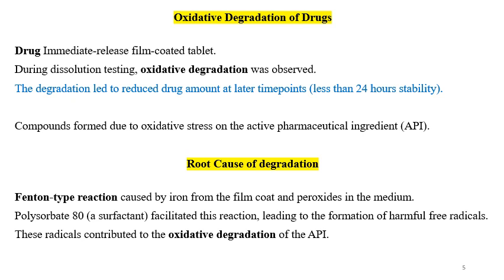So you might know that in the film coating of tablets and in the film coating of some pellets, colors are used. Those colors are ferric oxide colors, and those ferric oxide colors contain iron.